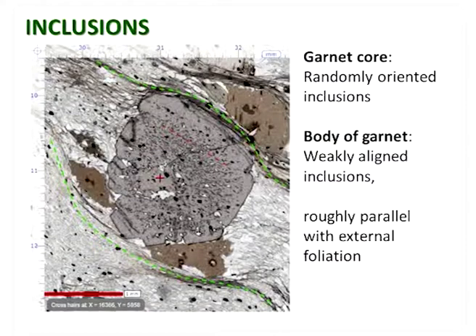But at other times you do start to see some orientation of the inclusions within the crystal. In this garnet, for example, there is a very faint alignment of the inclusions within it, up here. Down here, around the crosshairs, I don't think there is. There's actually virtually no alignment at all. They're quite random. But up here, I would say there's a very, very faint alignment running kind of northwest-southeast-ish, I guess, an alignment of those inclusion grains there. That's quite faint in that crystal.